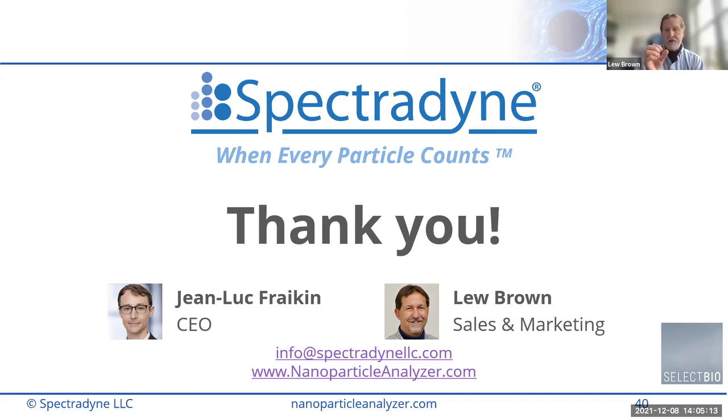And so what happens is that when the particle volume goes below a certain percentage of the size of the nanoconstriction itself, the signal produced by that particle, there's still a signal produced, but it no longer rises above the background noise, which means we can't tell you whether that's noise or a particle. And so the signal processing engine built into this automatically cuts off the particles that are smaller. And they don't affect the measurement of the other particles. They just pass through undetected.